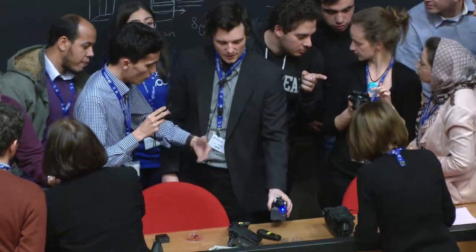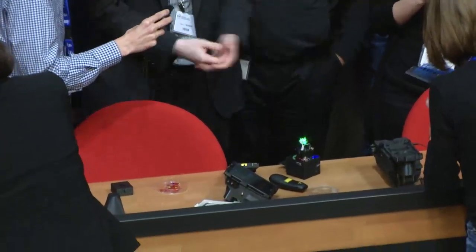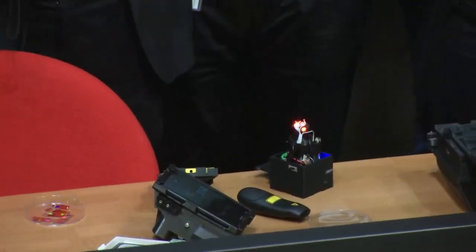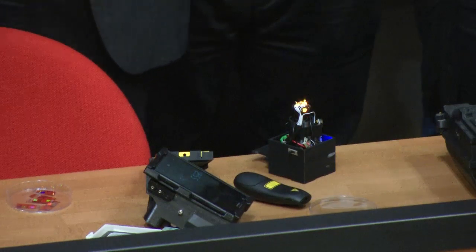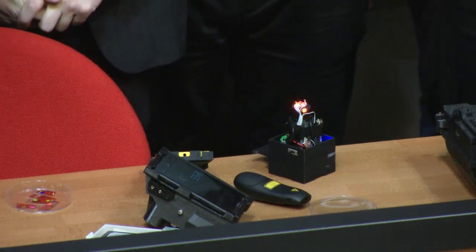Each LED is turned on individually, not at the same time. It has to be done individually. It's a scan. Here, they're turning on individually. It triggers the camera automatically to take an image. And if it was hooked up to my computer, it would save the image. So you get an image stack. It's like a hyperspectral stack, a multispectral stack. Just intensity, not spectrometry.